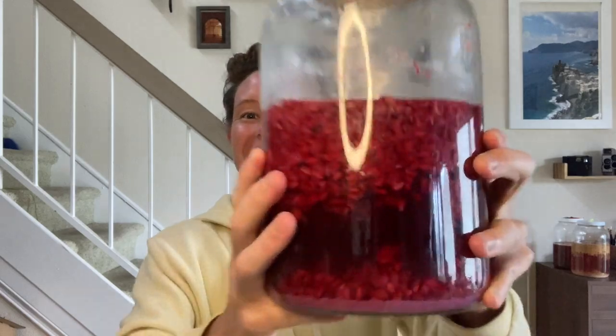This right here is wild fermented pomegranate wine. And because it's wild fermented, I wanted to know what microbes were responsible for the fermentation. So let's check out this pomegranate wine under the microscope.